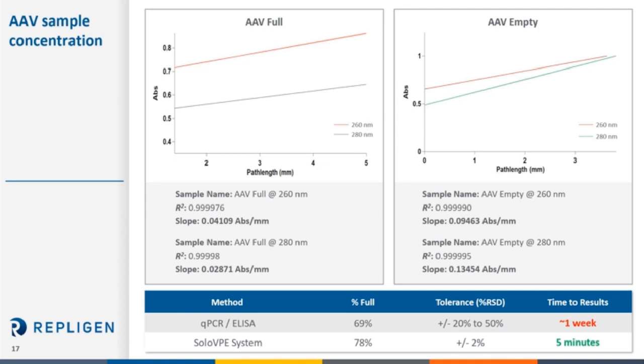What our goal is to see if we can find a way to be a comparable technology to save the analyst time and money when quick measurements within the process are required to take the next step. So I'm not talking about GMP release testing. I'm simply talking about a better analytic tool to make quicker and more accurate decisions.